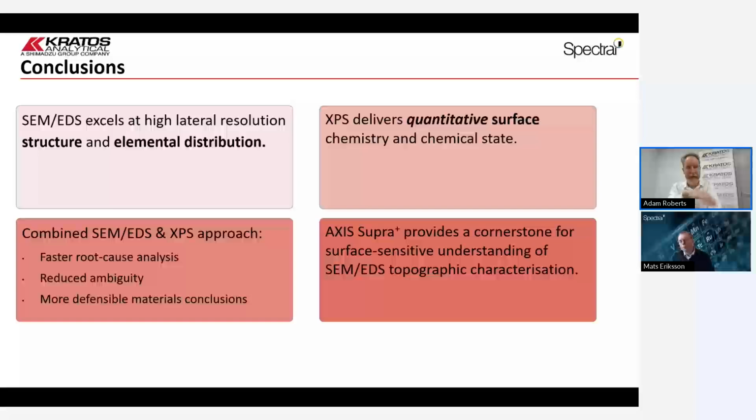So then are you very sensitive to topography? We had the shadowing thing, yes, of course, because you're illuminating with X-rays from the side, so you are sensitive to shadowing. That's right. But also, the topography and the angle of emission from the surface can cause challenges as well.